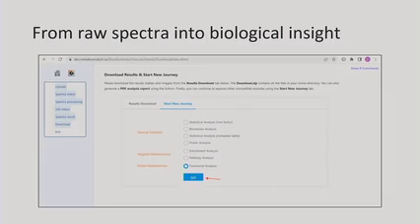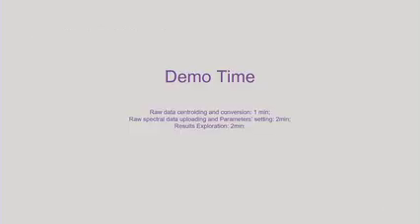After the raw data processing, it goes to the final page. Users can download the result directly, or they can use the results generated by the raw data processing module. They just select a different module and click go. The data will be transferred to the different modules. They can do any exploration online directly.